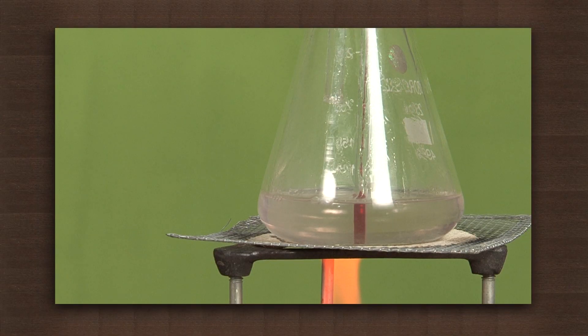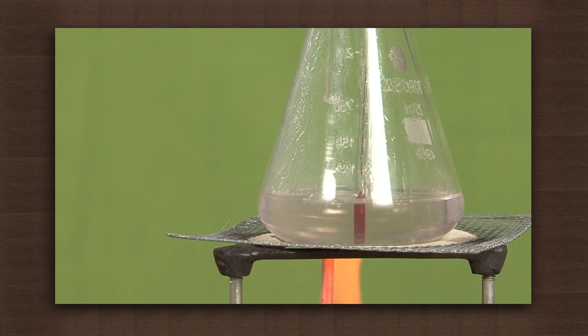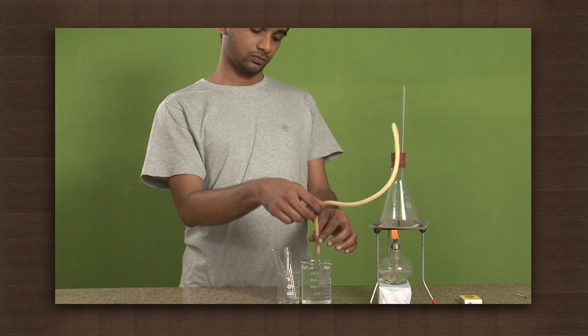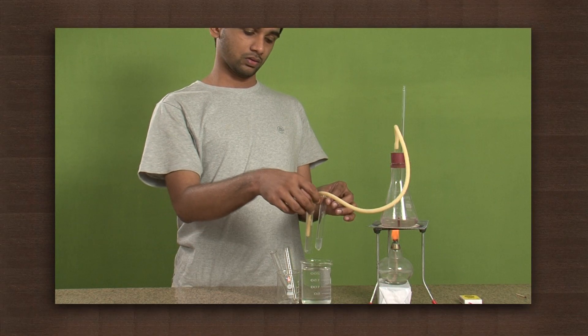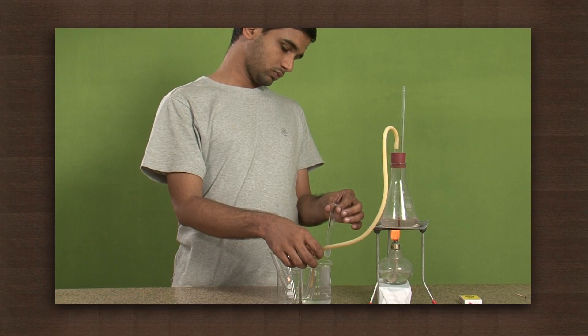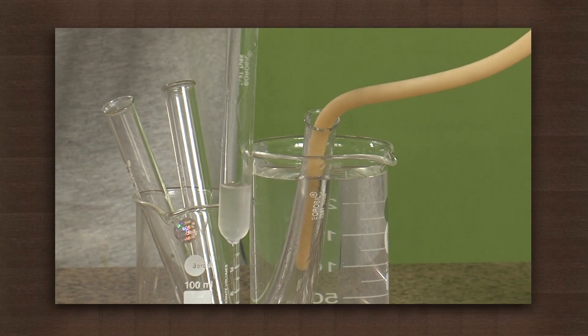Keep on heating the flask. After all the alcohol gets vaporized, the temperature starts to rise again towards the boiling point of water. The vaporized alcohol is collected in the test tubes in the purified form and all other impurities remain in the flask.